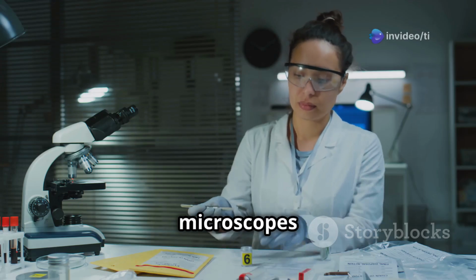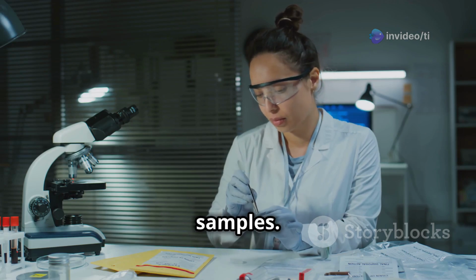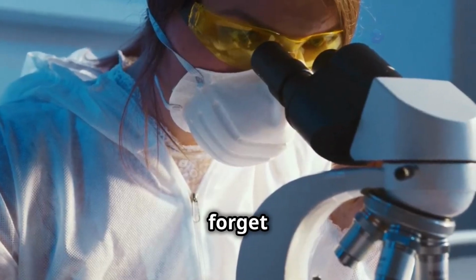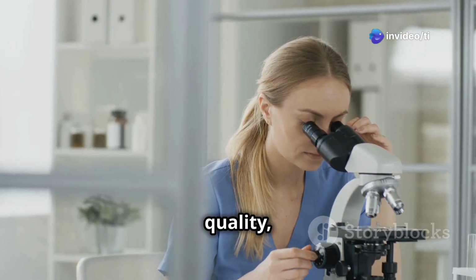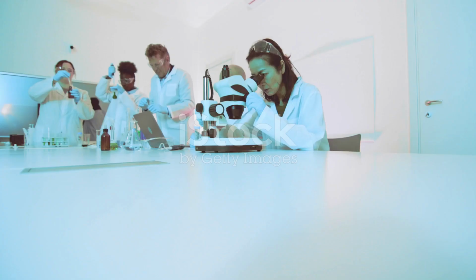Forensic scientists use microscopes to analyze evidence collected at crime scenes, such as hair fibers, paint chips, or even soil samples. By examining these tiny clues, they can piece together what happened and help solve crimes. And let's not forget about the environmental sciences. Microscopes help us monitor water quality, identify microscopic organisms in ecosystems, and study the effects of pollution on the environment.